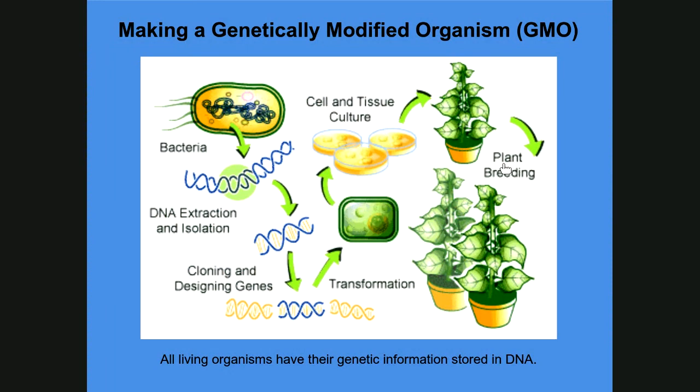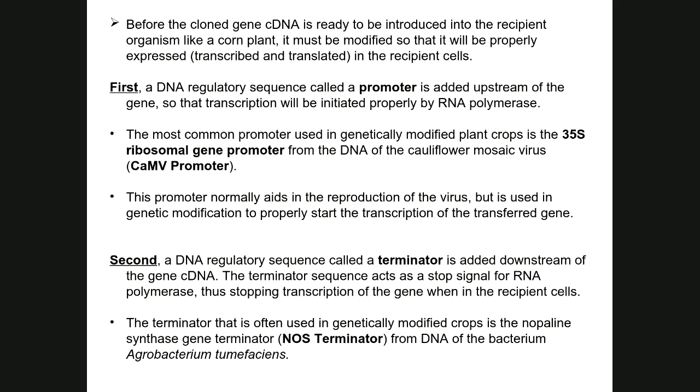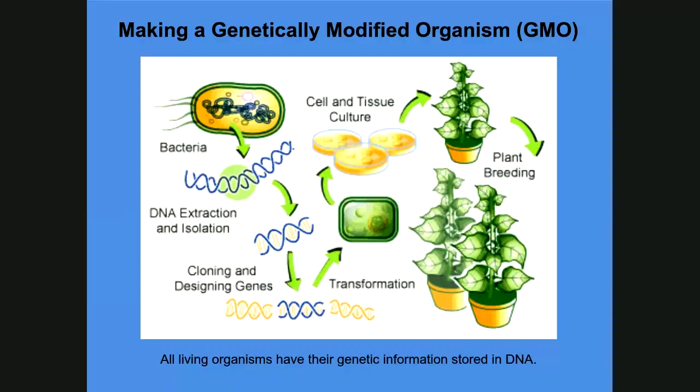Therefore, if somebody wanted to know whether those plants are GMOs, but they don't trust the person giving them an answer, if they can obtain some of that plant tissue and have access to the necessary lab equipment, all they would have to do is try to detect whether this promoter or this NOS terminator is present in the plant DNA, and then they would be able to verify, hey, look, that's not a naturally occurring plant. It's not organic at all.